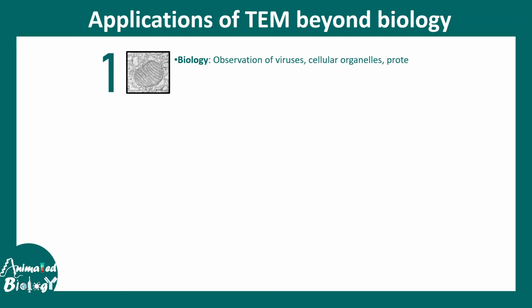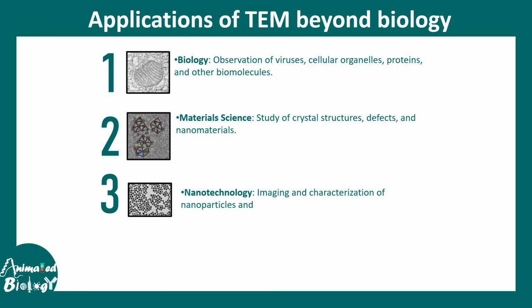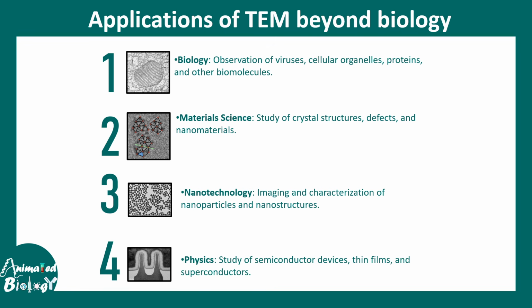There are different applications of TEM beyond biology. Obviously in biology, looking at the architecture of the cell, viruses, proteins, etc. could be useful. In terms of material sciences, in order to study crystal defects of nanomaterials, this particular technique is very useful. Nanotechnology and physics also have a lot of applications of transmission electron microscopy. So beyond biology, transmission electron microscopy is also really useful.